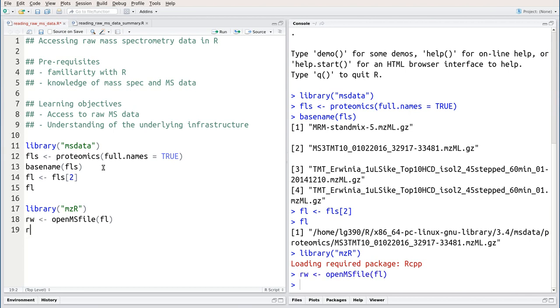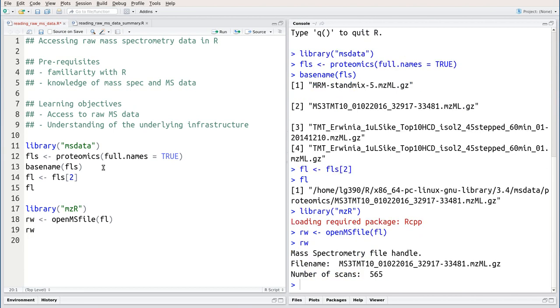This creates a mass spectrometry file handle, which is a pointer to the file we provide as input. As we can see here, this is a relatively small file containing only 565 spectra. But none of this data is actually loaded into R or into memory. All the data remains on disk and will be accessed on the fly when we need it.